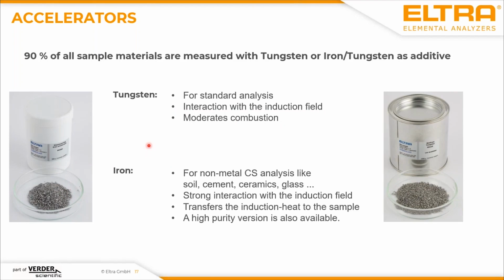On the other hand, tungsten burns with a very high combustion energy. So you get tungsten oxide, and when tungsten oxidizes to tungsten oxide, you get a lot of additional energy, in addition to the energy you get from the induction field. So it's a very nice metal to get better results when melting the sample. So you get higher temperatures, higher than the 2200 degrees.